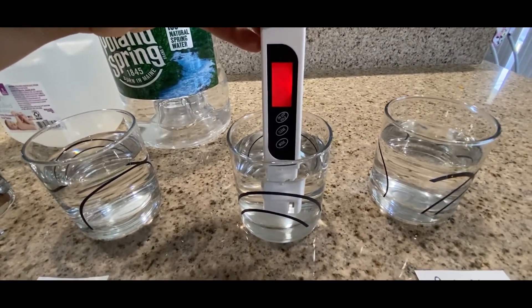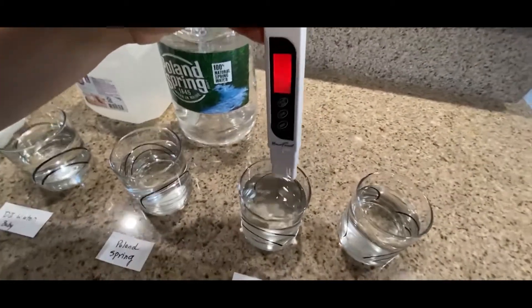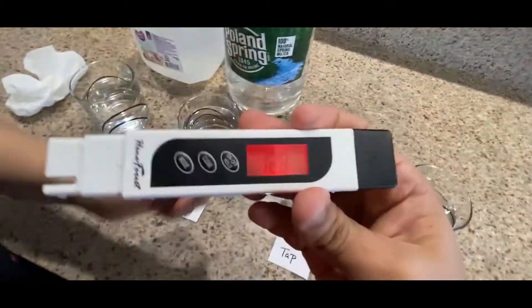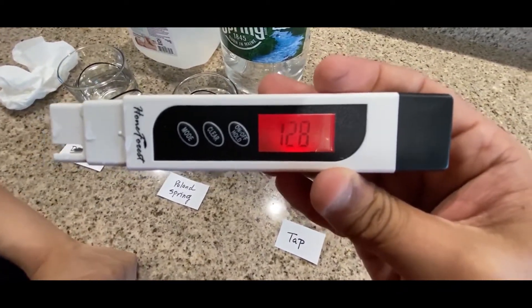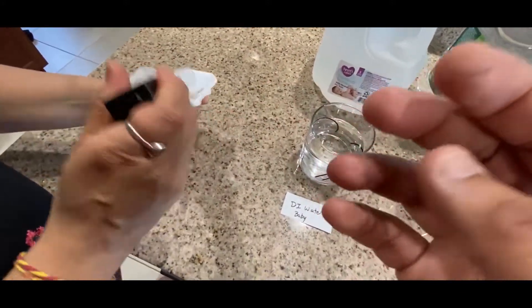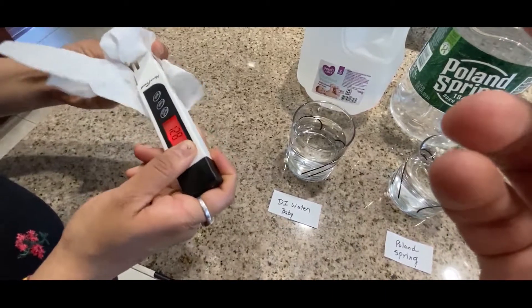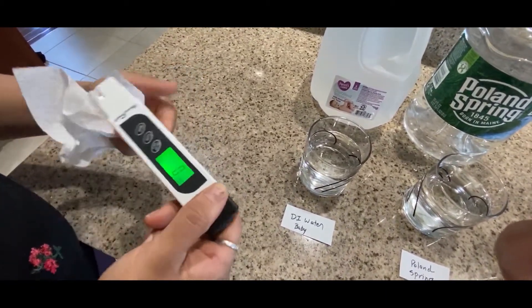Here's my tap water reading — it comes out to be 128. That is the reason I switched and installed the reverse osmosis system, because that's quite high. To be honest, we don't know exactly what's inside that water — if there's lead in there.